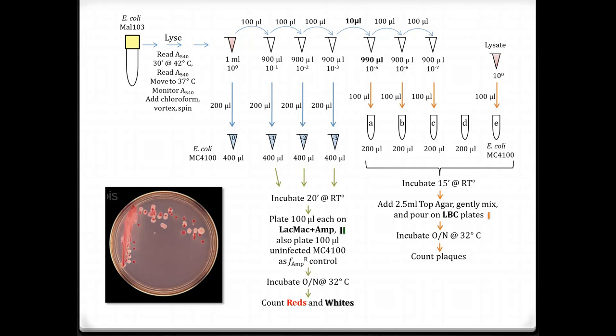So you are better off coming by later the next day. Now, if you leave them there for several days, those white colonies slowly turn pink and eventually red, because all cells do produce waste, and that waste is acidic, and everything slowly turns red. So you must check your data. This is why I tell you that your data will go away on these plates. The acid's produced, and everything turns red.